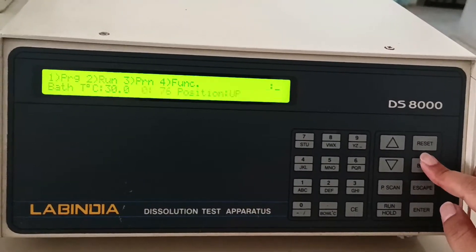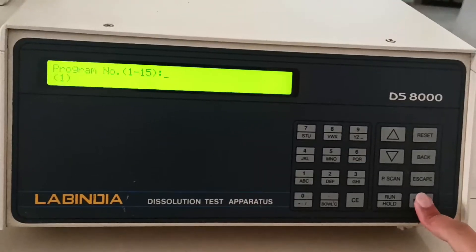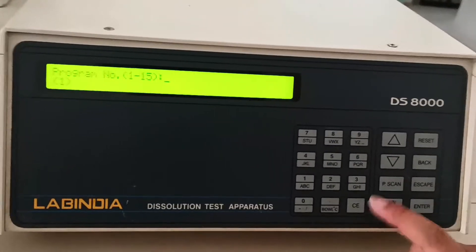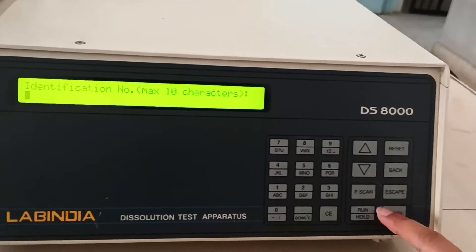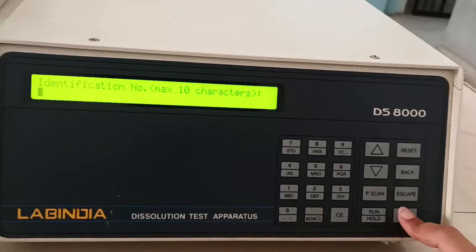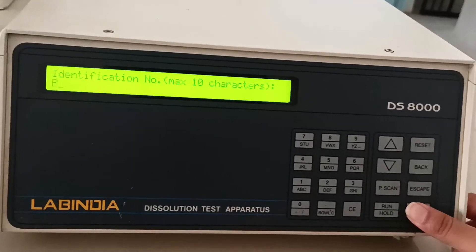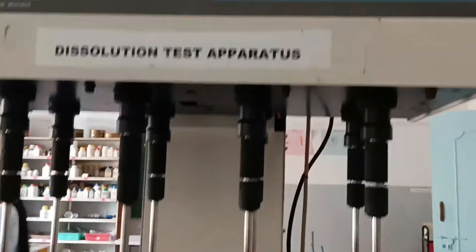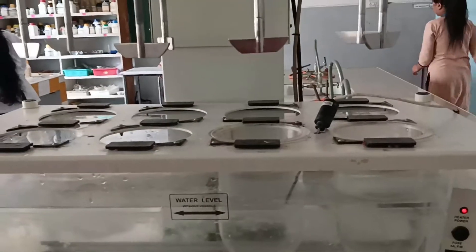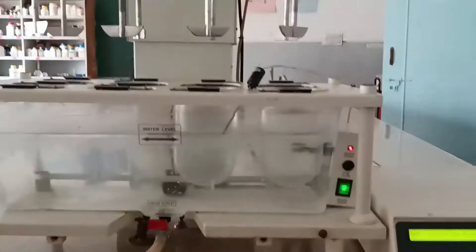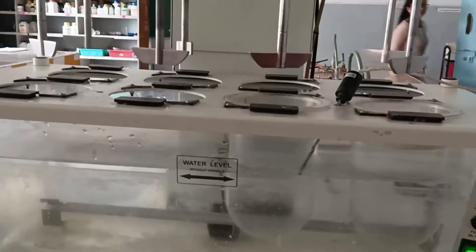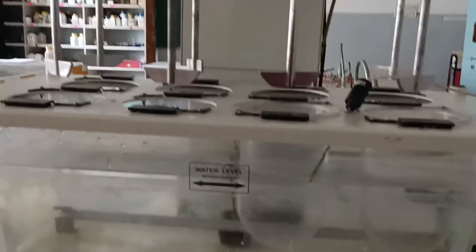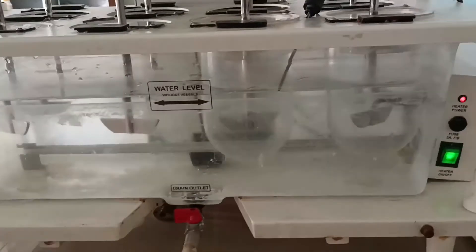Now run by pressing number two and enter. Then select the program you set - put number one and enter. Write P as the identification number.